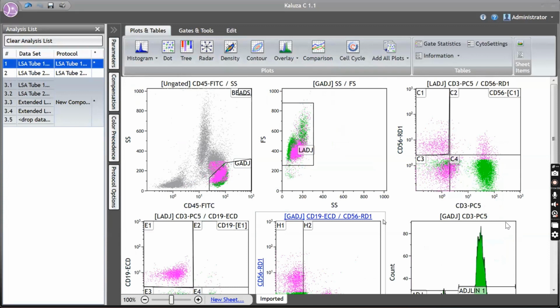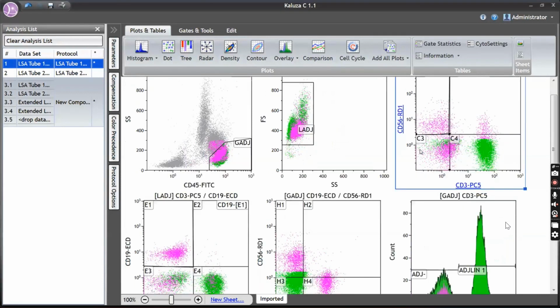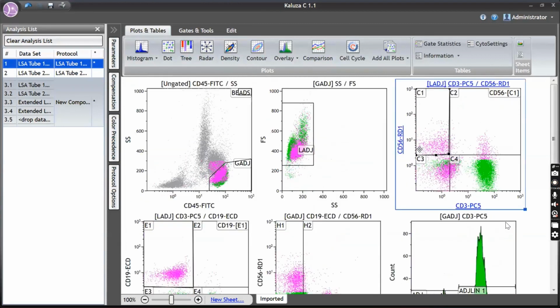Okay, now we'll go ahead. See, this is what I told you. When you have a file like this, it is because a preset template was set in the machine and you already have preset gates formed here. When you don't have an efficient flow cytometrist to interpret the data and still you want to do CD4 counts, the company application person draws the gates with control samples.